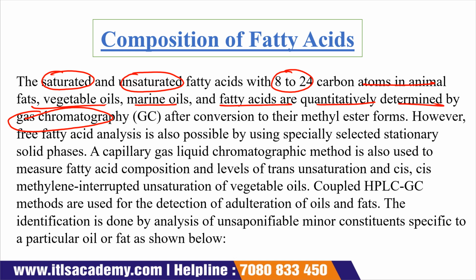Okay, either in animal fat, vegetable fat, or marine oil, the fatty acids are determined by gas chromatography, and it is determined quantitatively, not qualitatively, which means how much amount of fatty acids are present after the conversion to their methyl ester form. However, free fatty acid analysis is also possible by using a specially selected stationary solid phase.